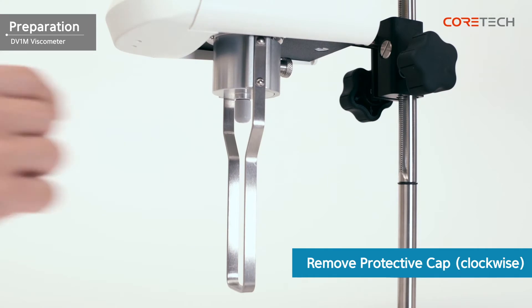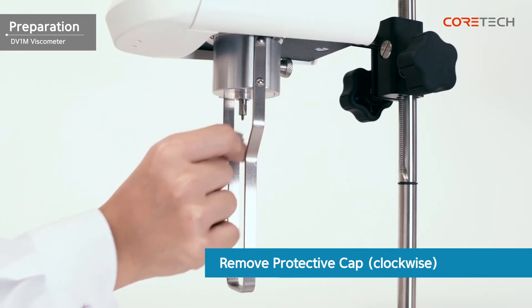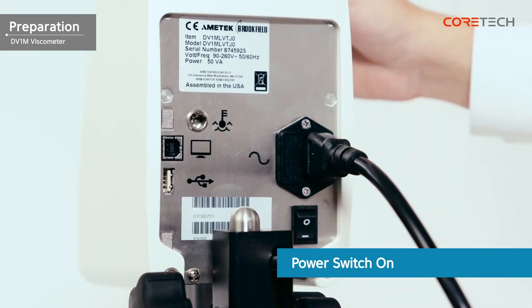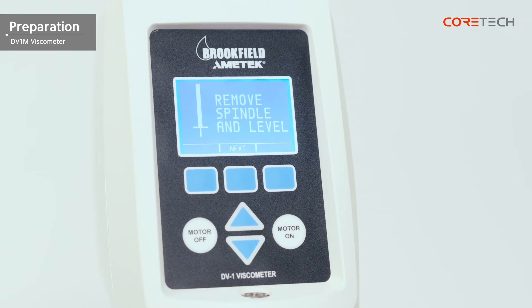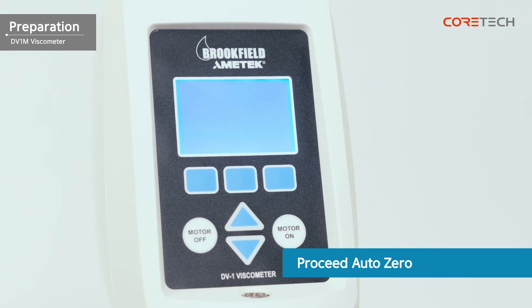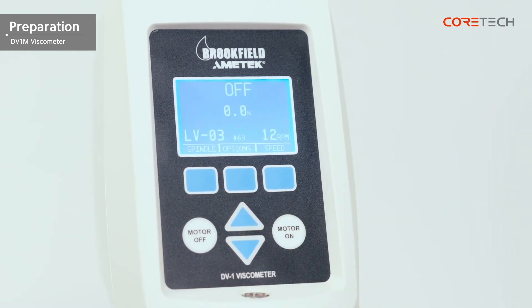When the guard rack installation is complete, turn the protective cap clockwise to remove it. When the power switch is turned on, the message 'Remove spindle and level' is displayed. Make sure that the spindle is removed and the instrument is level, then press the Next button. Proceed to auto zero for a while. The message 'Replace spindle' is displayed. Press the Next button again to go to the main screen.